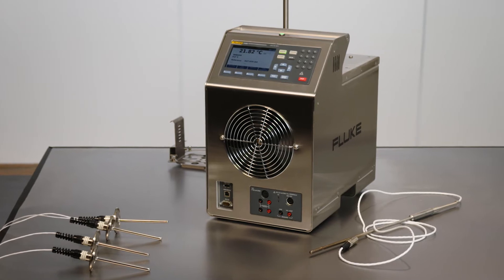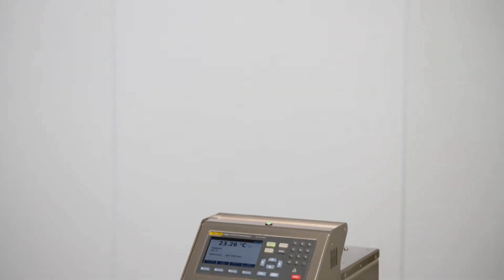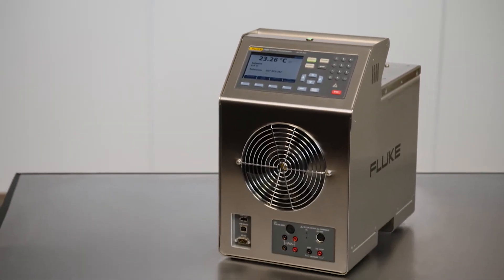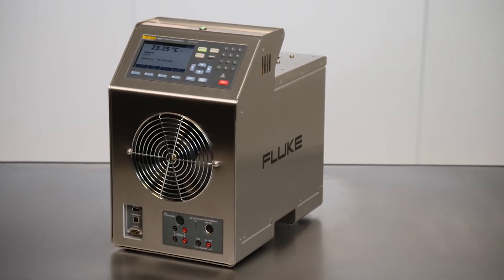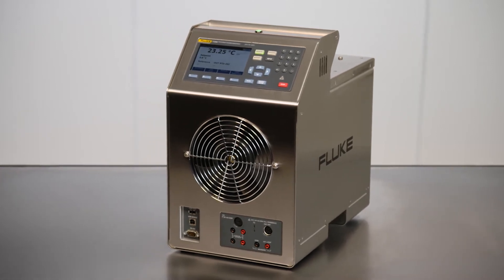Let's demonstrate how to calibrate four tri-clamp sanitary sensors at a time. We'll use the 7109A-P model for this demo. The procedure is the same for the 6109A-P model as well. The Fluke 7109A bath has a temperature range of minus 25 to 140 degrees Celsius.